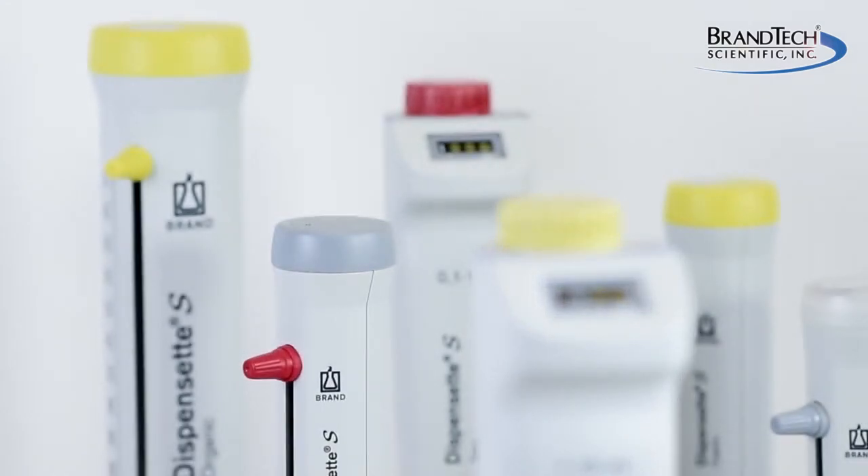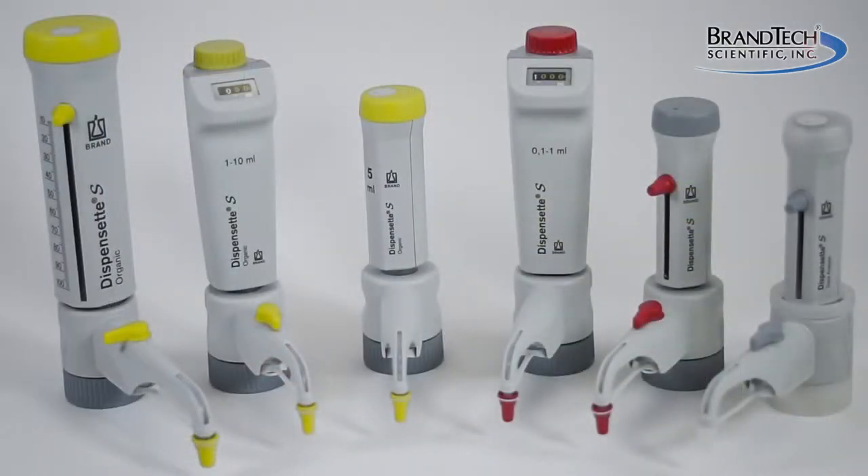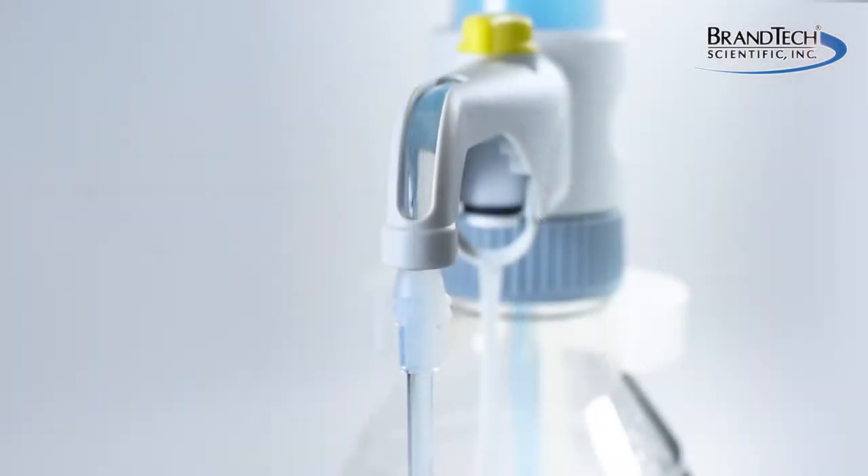BrandTech Scientific is pleased to introduce the new Dispensette S bottle top dispensers from BRAND. Manufactured in Germany, they represent a half century of expertise in making the world's safest bottle top dispensers.